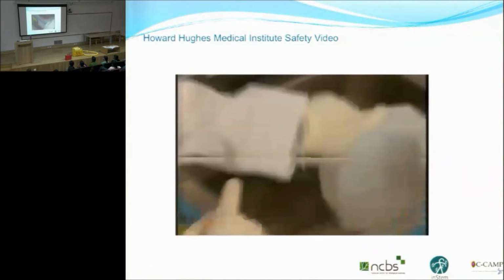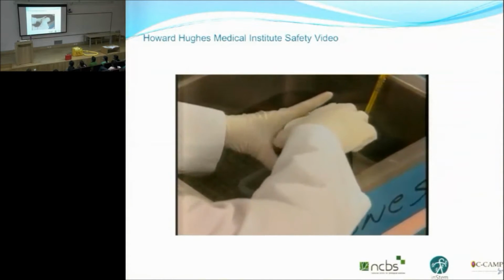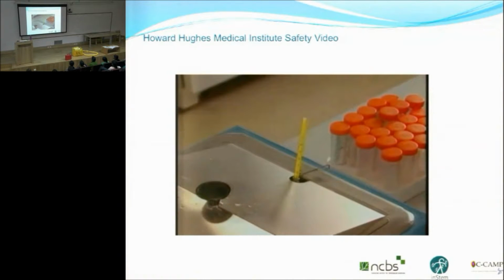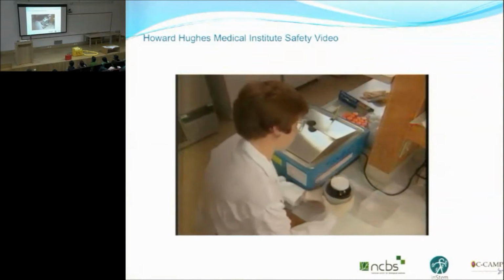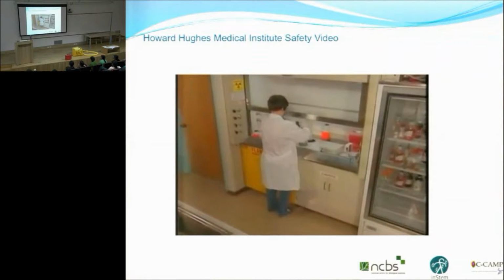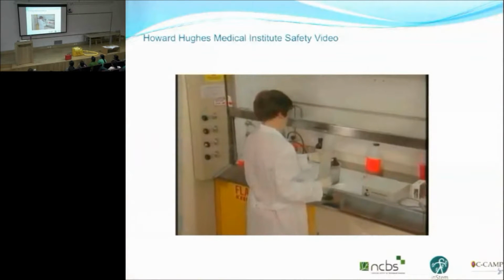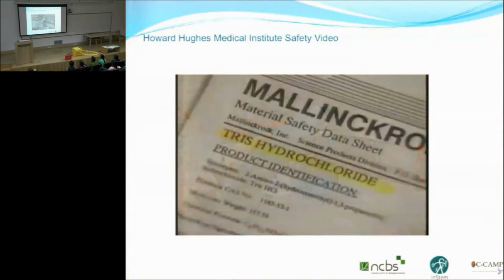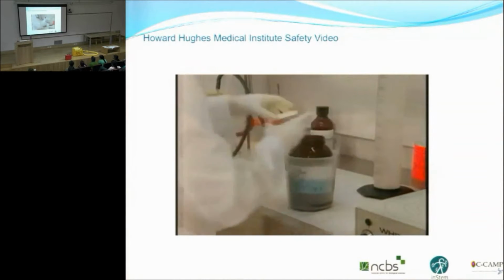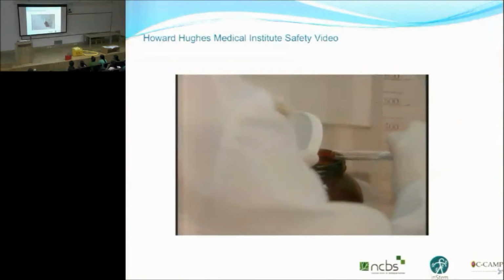Gretchen makes sure the phenol is at room temperature before melting it. She also allows for heat expansion in the bottle. Gretchen knows not to put the warm phenol bottle on a cold surface because the glass could crack and allow the phenol to run out. The MSDS for tris hydrochloride tells us it may cause irritation of the skin and eyes. Here's an opportunity to avoid splashes.